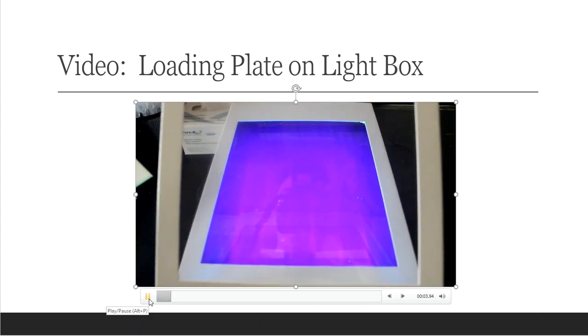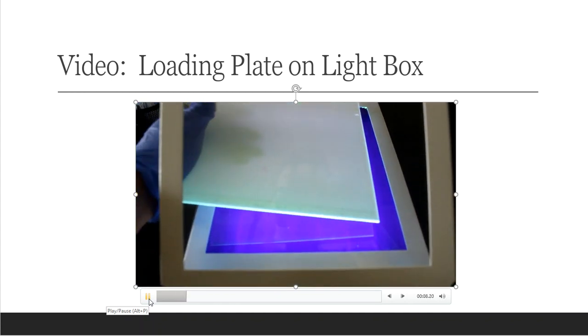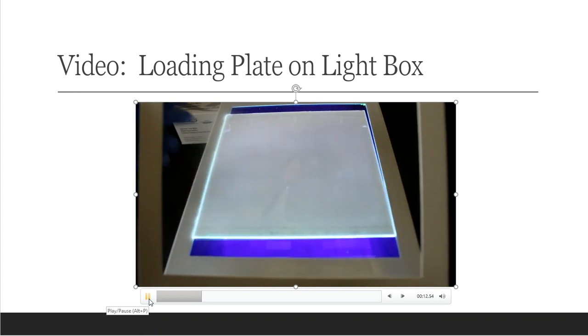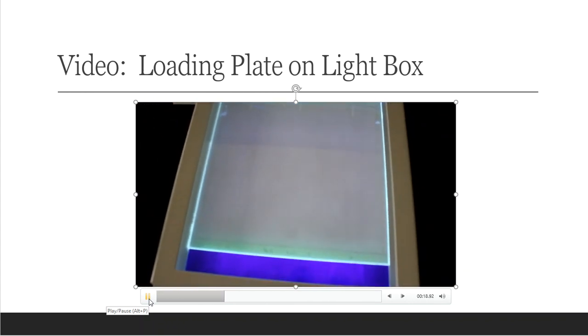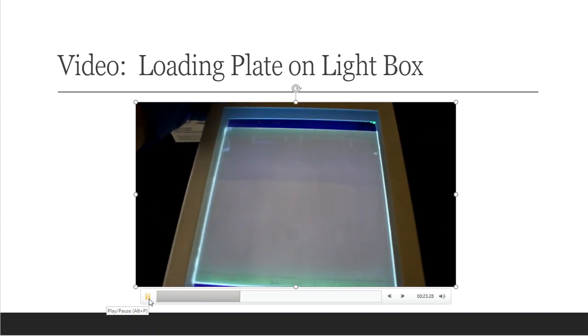Okay, guys, so many people load up the TLC plate the wrong way. Right now, the silica is actually on the front side that faces toward me. I'm going to lay the plate down, and then this is what most people do because they think this is proper, and they'll close the lid to the transilluminator, and notice they really don't see anything. I mean, nothing really shows up. That's because you've got it in here backward.